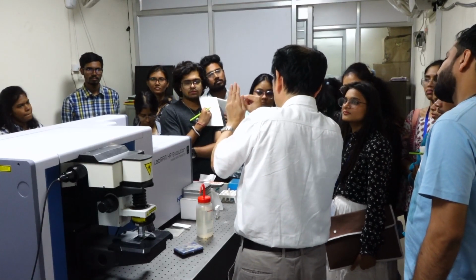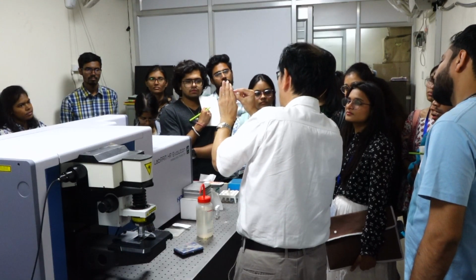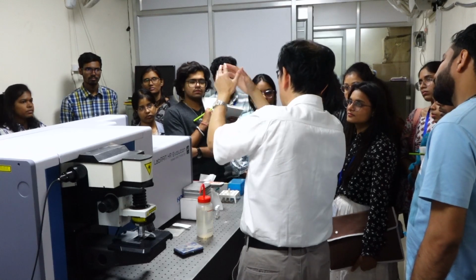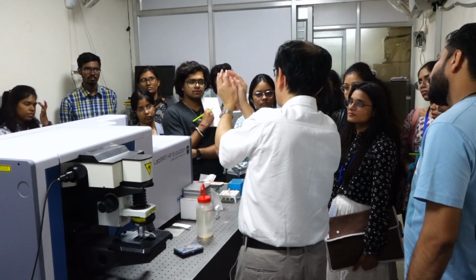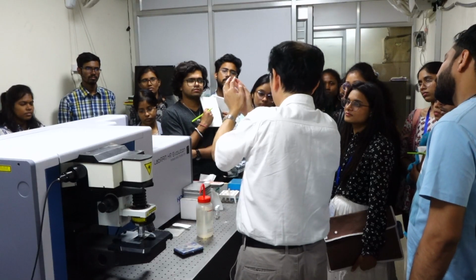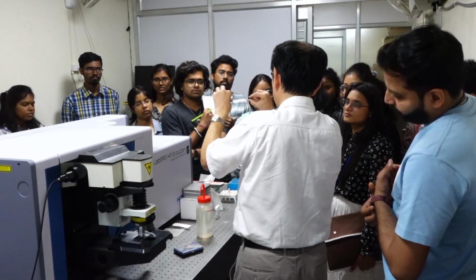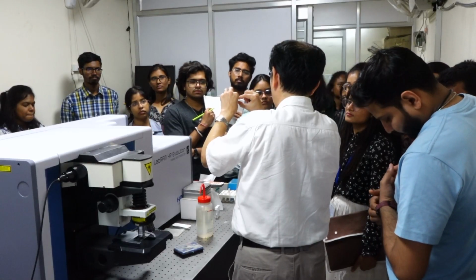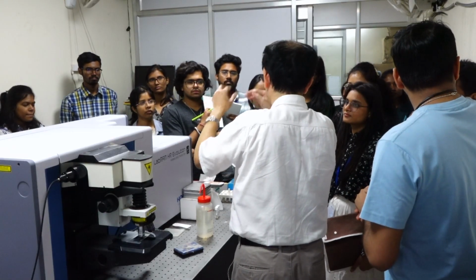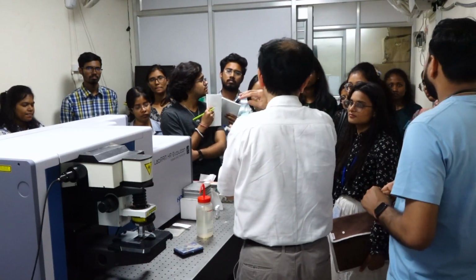If the sample is extremely thin, only a limited part of the focal volume is used. If the sample is thick enough, the focal volume is all covered by the sample. In that sense, an extremely thin sample does not give a strong signal. So some thickness is preferable.